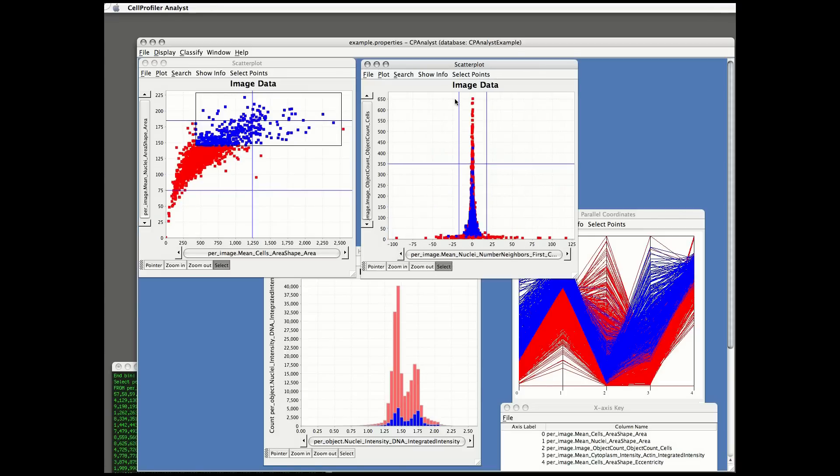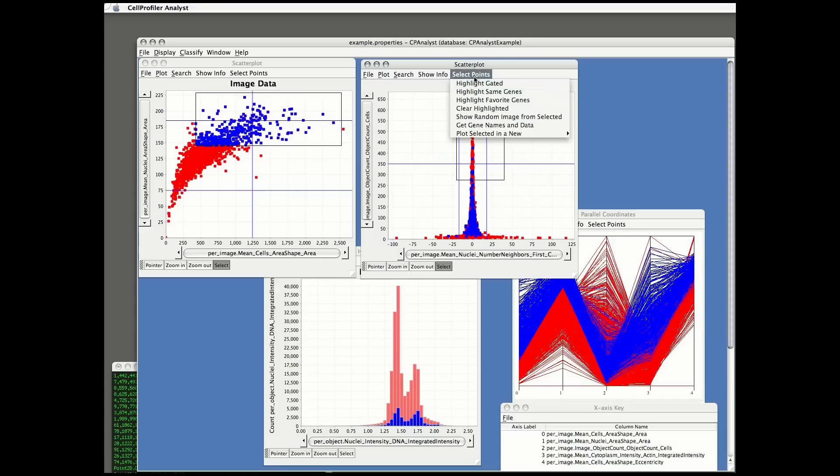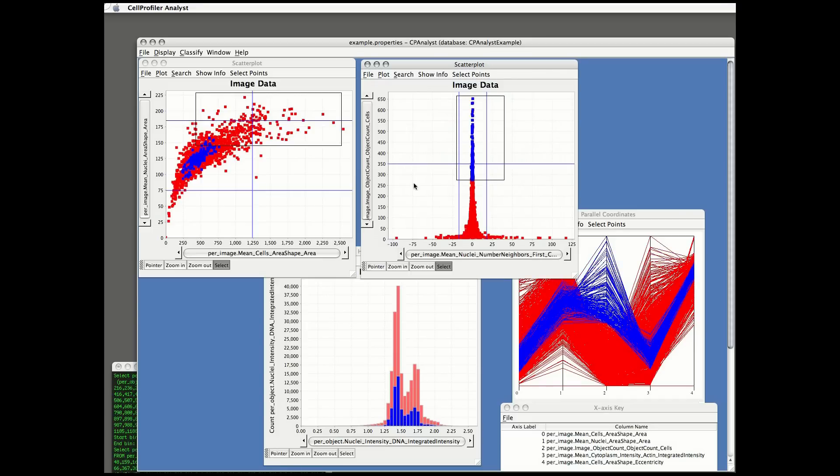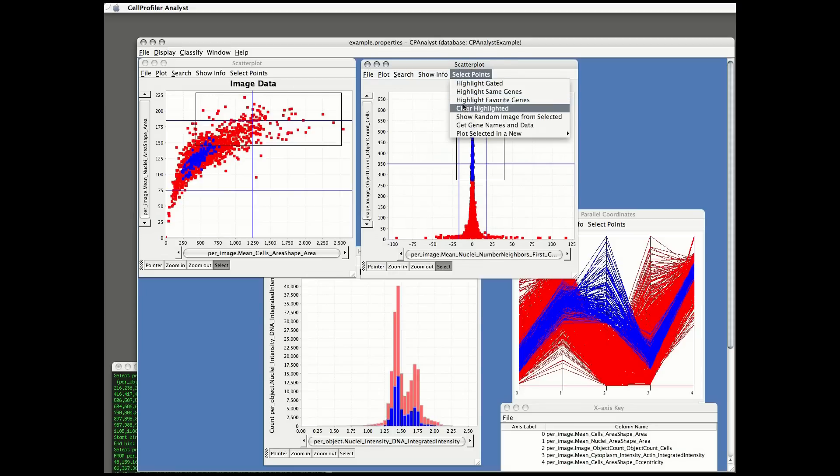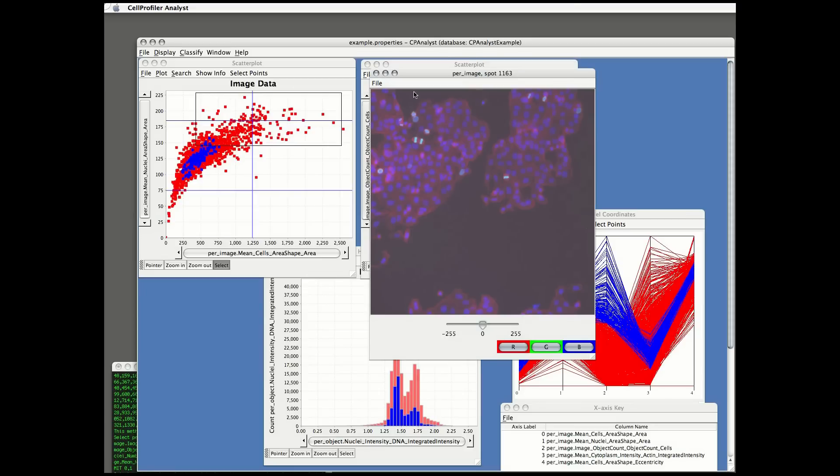And now I'm going to highlight samples with high object counts, so high cell counts. And then I can see in the other scatter plot that those images with higher cell counts tend to have smaller cell and nuclear area. That's what we would expect when the cells are very crowded in the images.